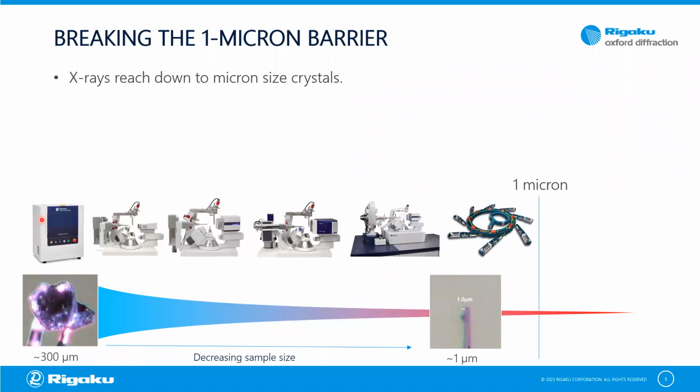But for all of those, there's a certain limitation: with X-rays in general, it is relatively hard to go below a size of roughly 1 micron with your crystal size to get a sufficient signal for structure solution from a single crystal, unless you go for exotic techniques like free electron lasers or maybe some serial crystallography at synchrotrons. But by default, this is sort of a barrier.